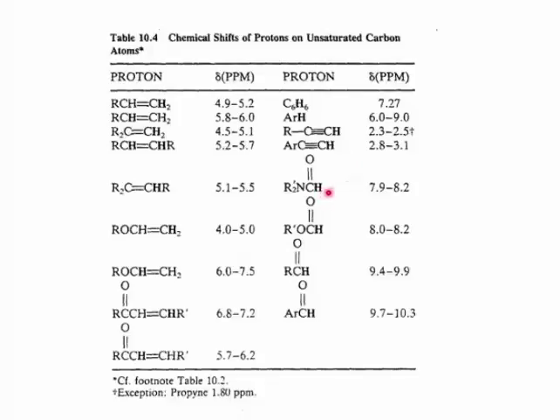Hydrogen that's attached to a carbonyl carbon, notice how high the delta value is. It's highly de-shielded, and the reason for that will also be explained later.